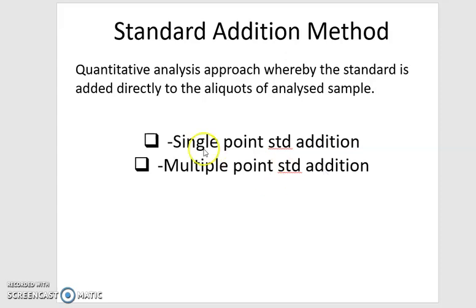And in the multiple point standard addition, the quantification is based on a calibration curve.